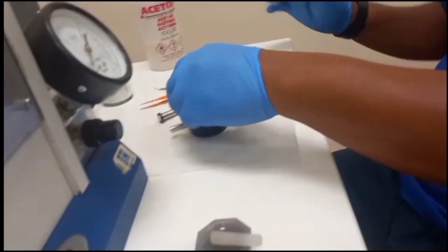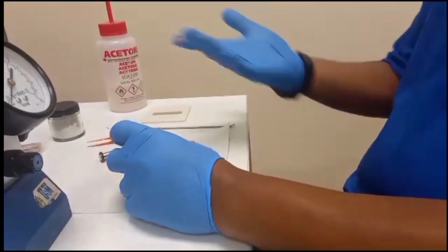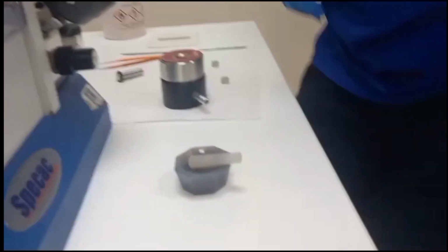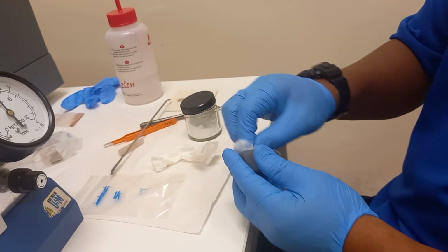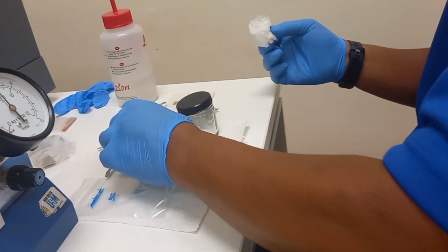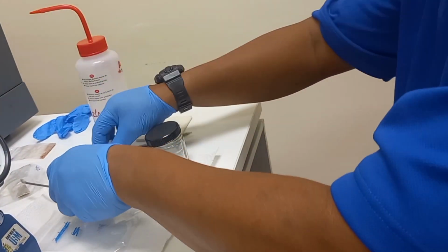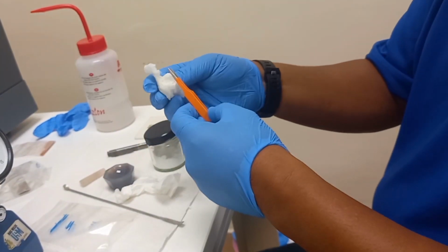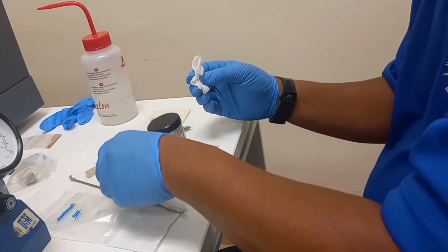The transmitted or reflected light from the sample is collected and directed into an interferometer. The interferometer divides the light into two beams, one that travels through the sample and the other that bypasses the sample. The one that bypasses the sample is called the reference beam, and the one that traveled through the sample is the sample beam. The two beams are then recombined, creating an interference pattern.